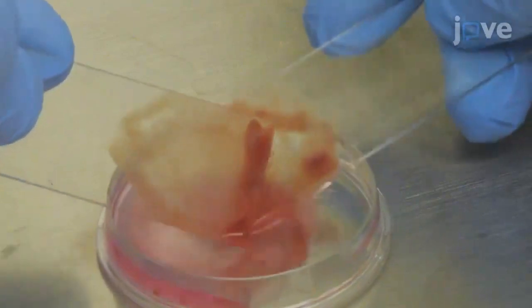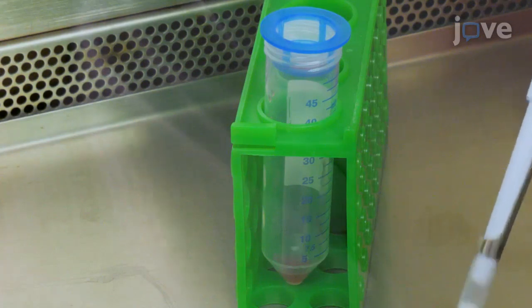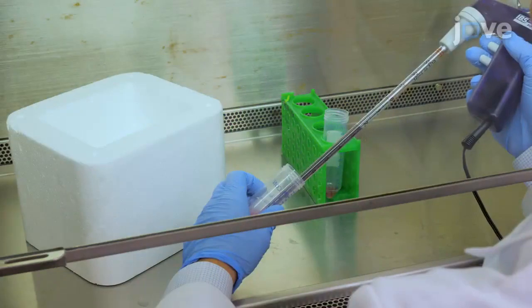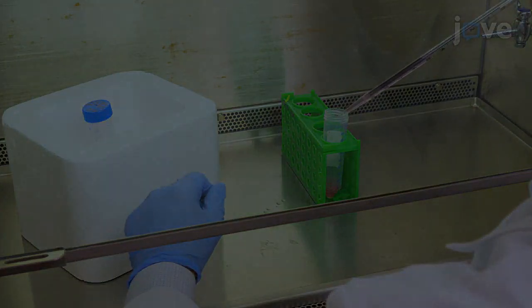Once thoroughly homogenized, pipette the 2 milliliters of culture medium containing the splenocytes through a 40 micron nylon cell strainer into a 50 milliliter tube. Add 8 milliliters of cold culture medium to each of the 50 milliliter tubes containing the splenocytes for a total volume of 10 milliliters per tube.